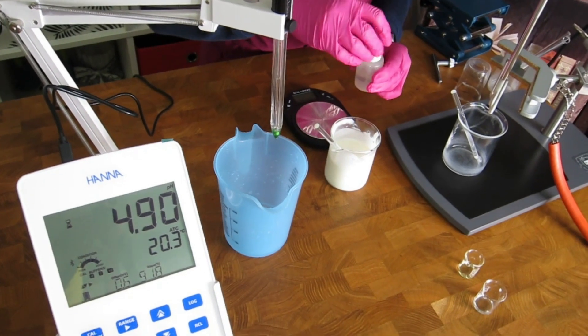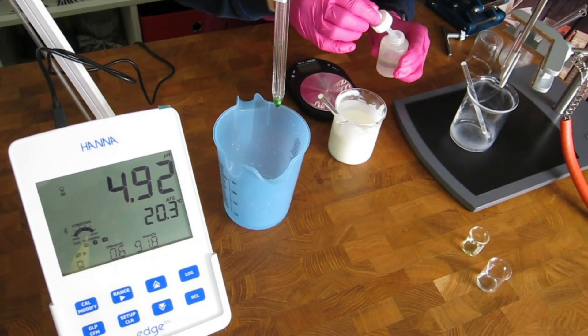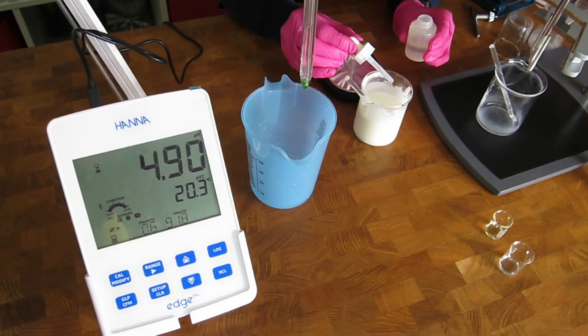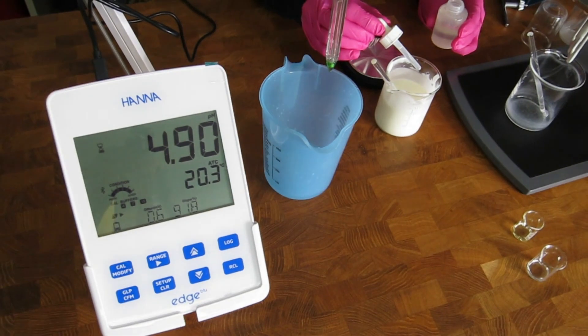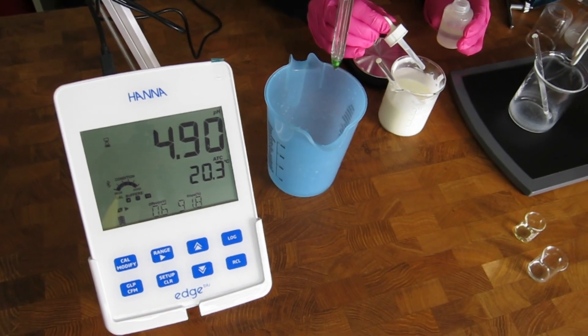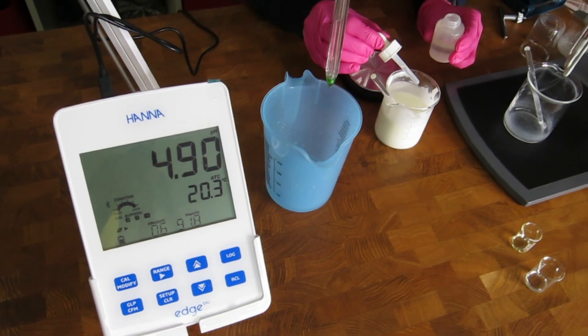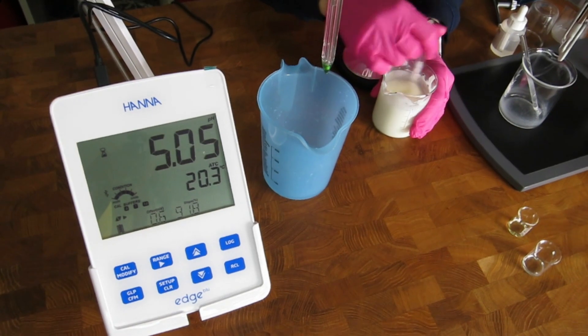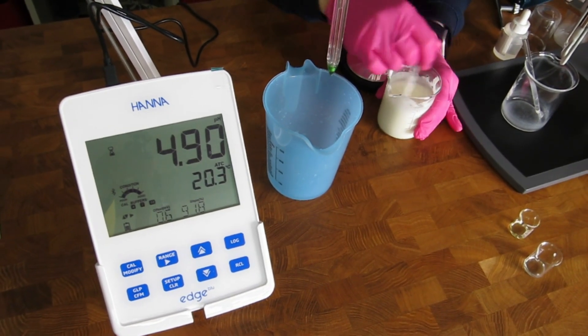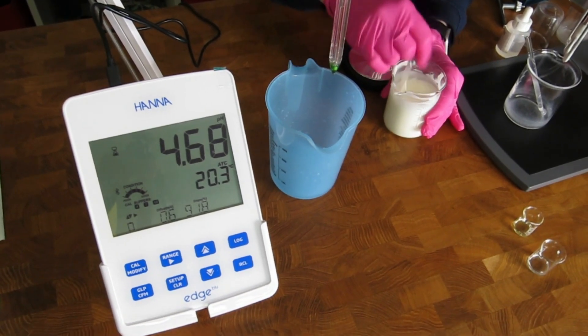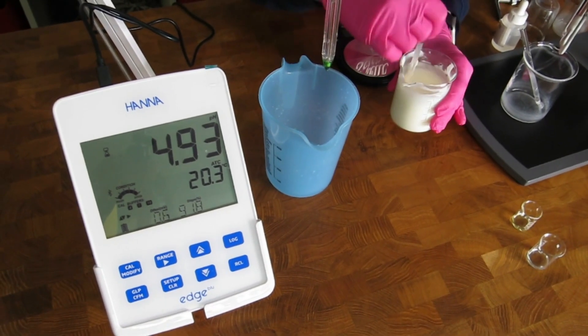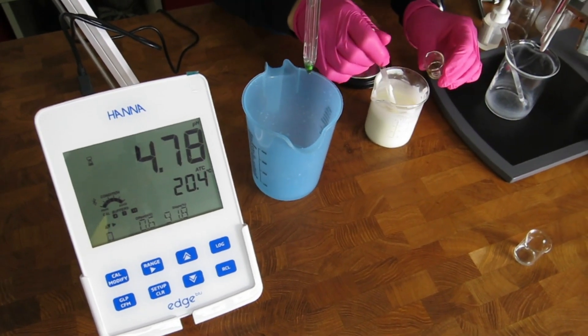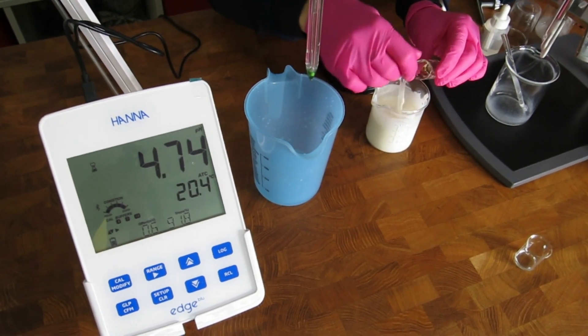We will now add lactic acid to the emulsion to reduce the pH. Since we have cheated earlier and prepared this emulsion several times, we know how much we need to add. When you are making the formulation for the first time, you have to go slowly and add the lactic acid gradually, so that you don't jump to the other side of the pH scale. So we can now add the essential oil, the preservative, and then prepare another 10% dilution and re-measure the pH.